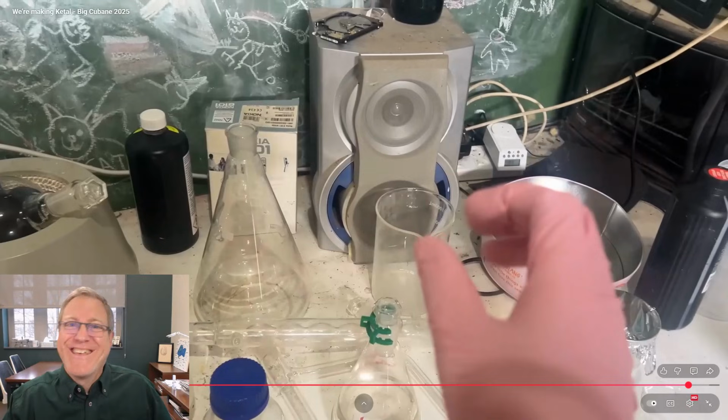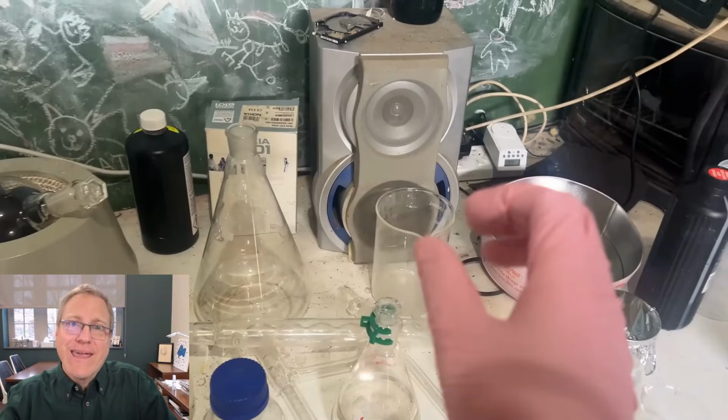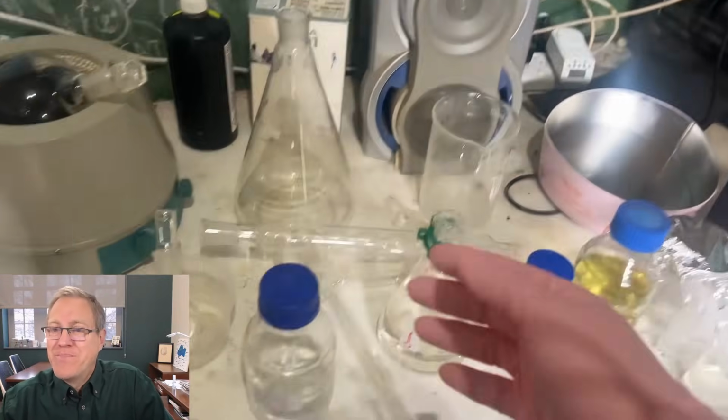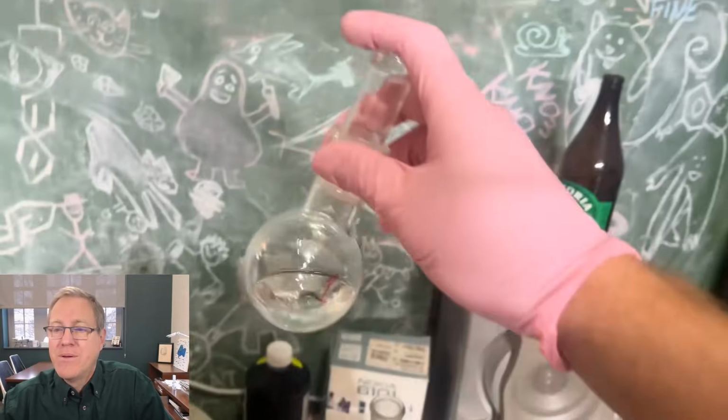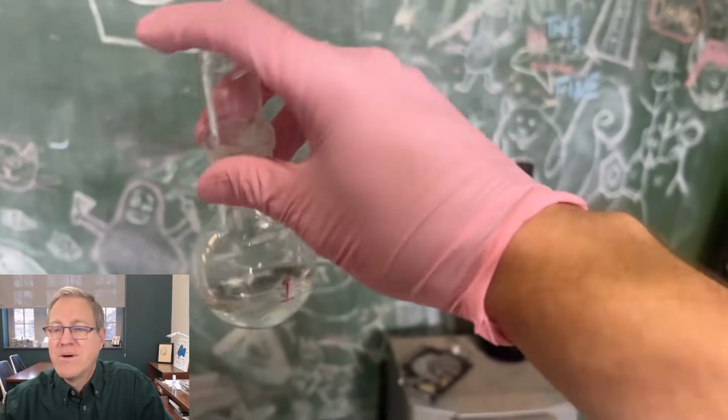Oh my goodness. If I could do a backflip, I'd be doing backflips. I think that's a great result. He's just wishing he got more. Every organic chemist wishes they got more. Getting caught in the lines and in our cold trap at the end. And even this first fraction definitely contains quite a bit of toluene, but probably also contains quite a bit of product that we kind of have to throw away.